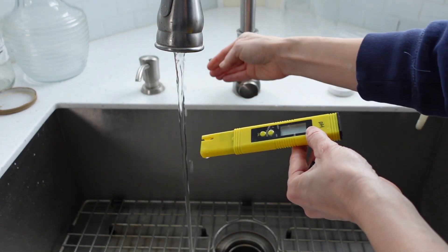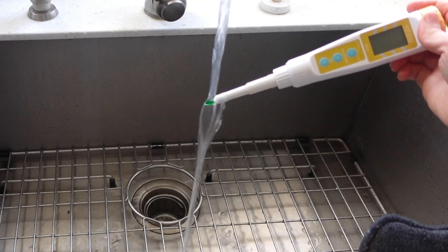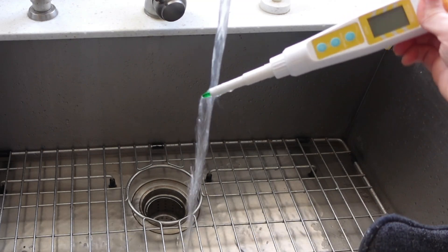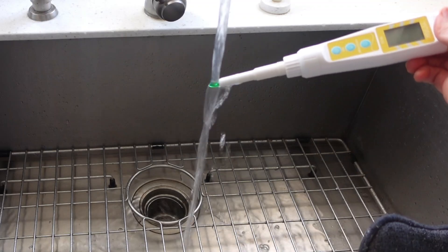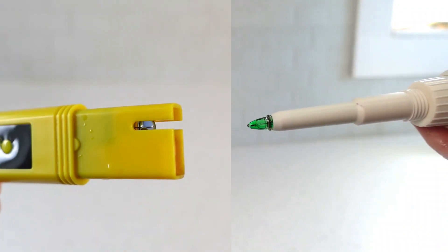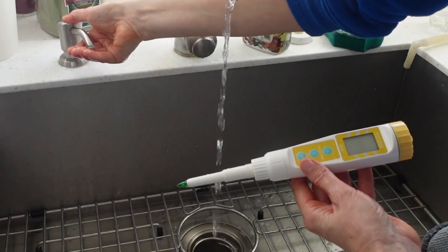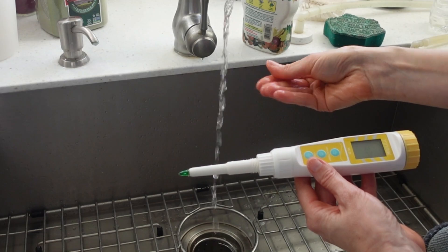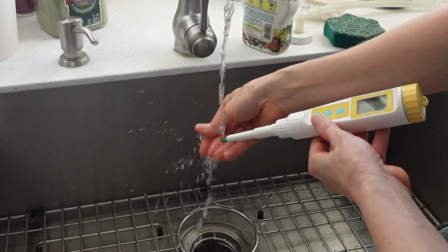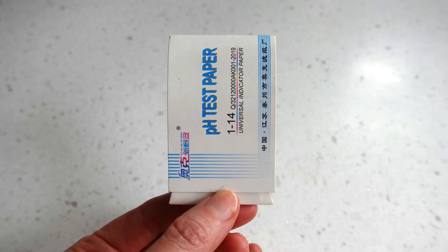Rinse the basic meter in water only. The upgrade meter is designed for contact with more than just liquid and the probe is exposed, so it is easier to fully clean with water rinsing. I have found the glass of the probe to be more durable and therefore less susceptible to breaking if touched. The instructions advise against it, but if absolutely necessary you could use your fingers with a little soap so long as you're very, very gentle. No cleanup is needed with the pH strips — just keep the packet away from any moisture.